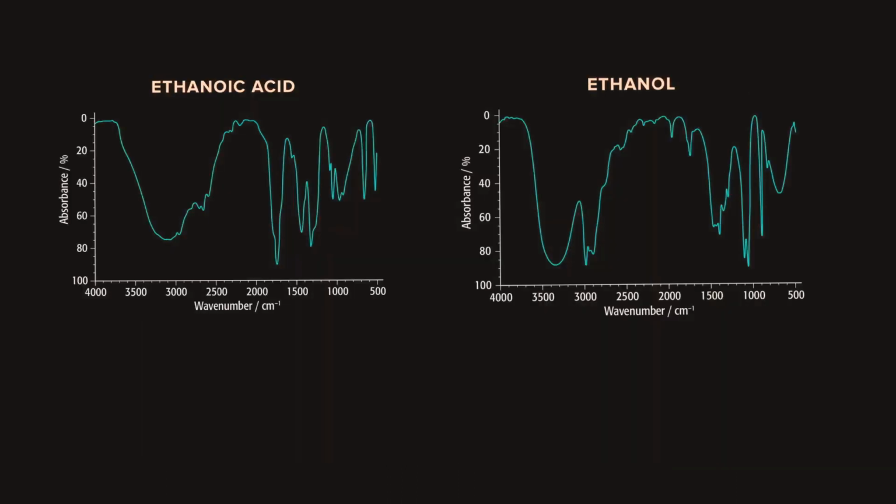Moving on. When you have a hydrocarbon, the bond you'll end up seeing, especially in infrared spectrum questions, is the CH bond. This is going to be the most obvious one. It's a hydrocarbon, so you will have CH bonds and carbon-carbon bonds. You really don't need to look for these. It's obvious they'll be there.